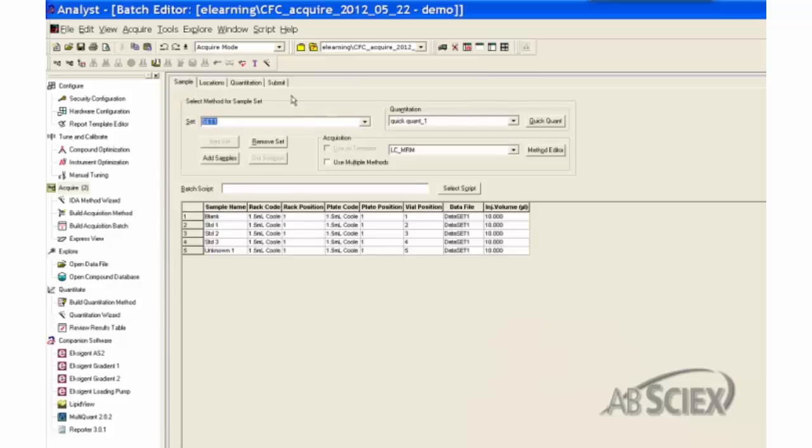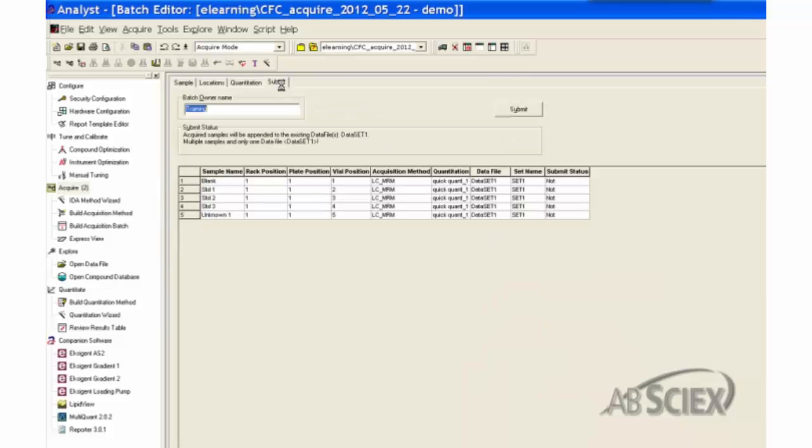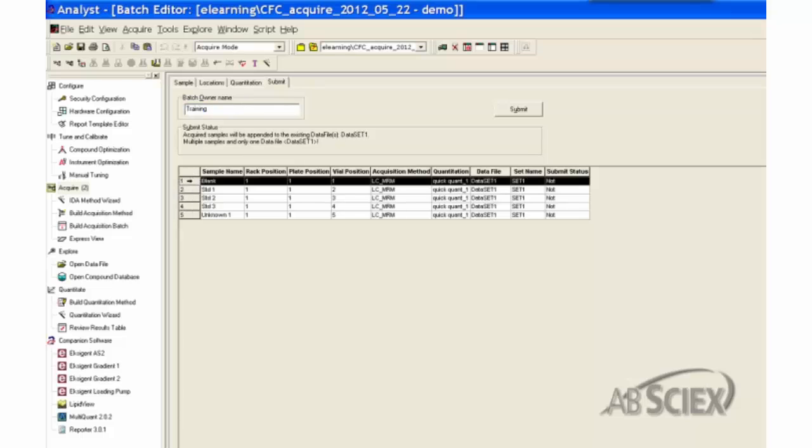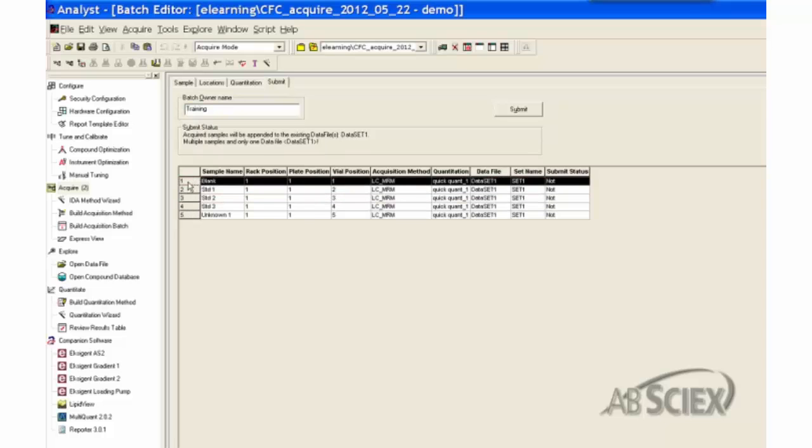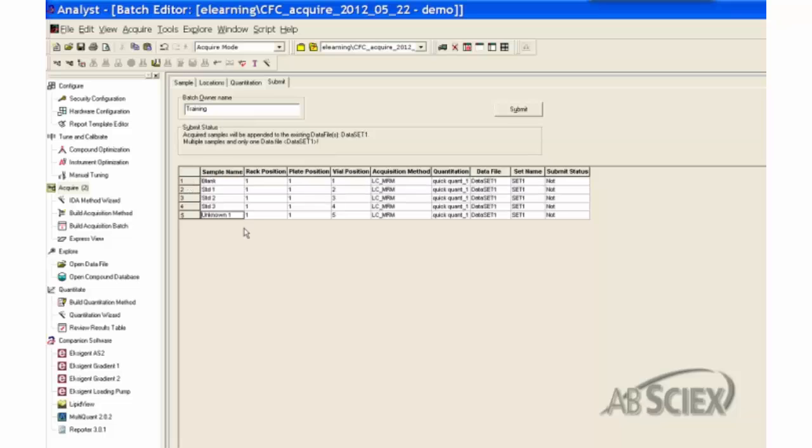All the samples listed in the sample tab show in the submission list. The order to submit samples can be changed here by selecting the specific row and dragging it to the desired location. This is the only place where sample order in a batch can be adjusted.